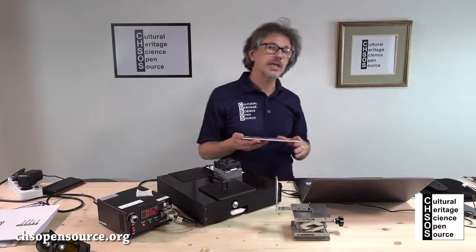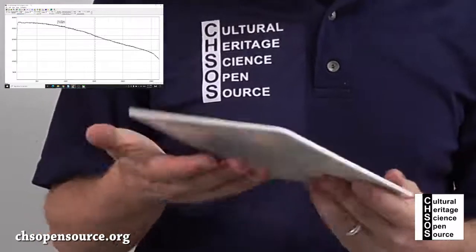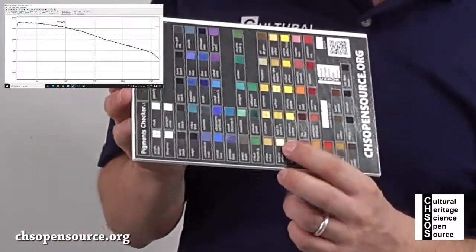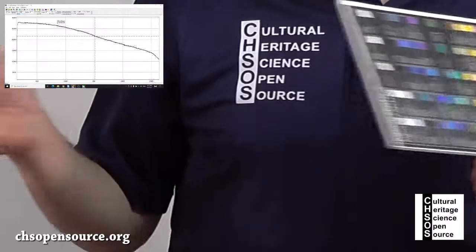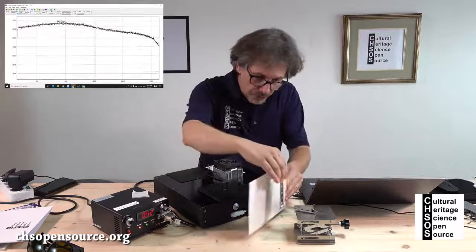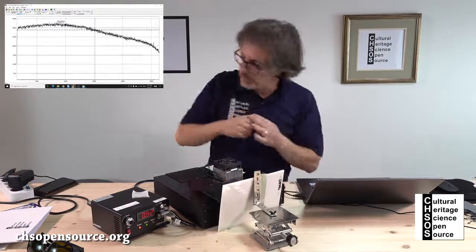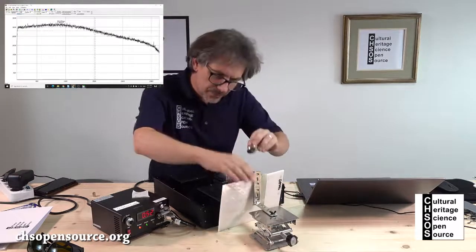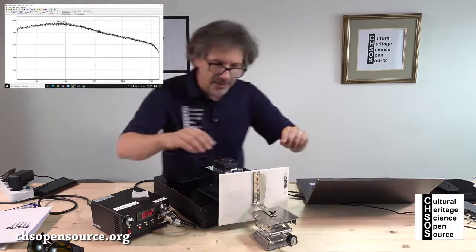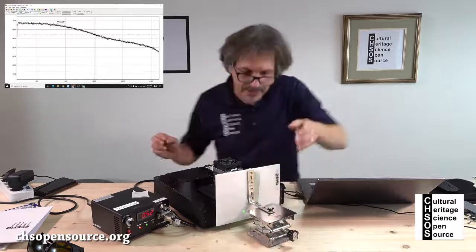We now present another example about the use of the slit. In the pigment checker, we are going to check a pigment like lead tin yellow, which has a strong signal, and we see what happens when we change the dimension of the slit. We are going to put it in position here, using some magnets to hold the pigment checker in position, one over here and one over here. And okay, lead tin yellow, there it is.